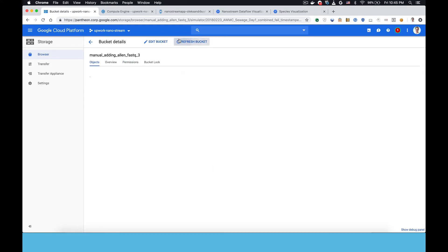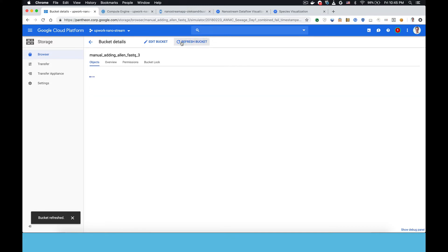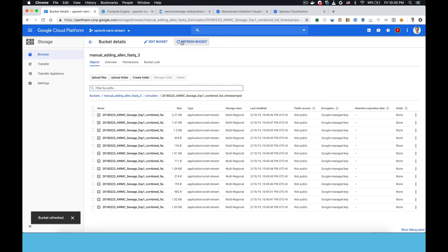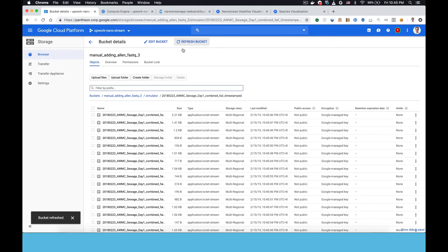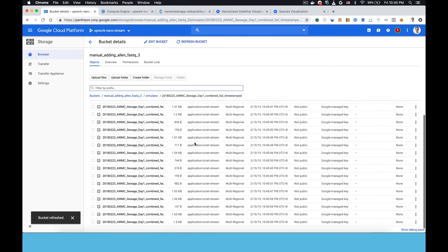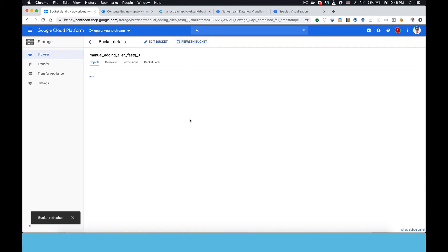Here's the bucket they're going to and it was empty and now you can see reads are appearing. The newest ones are at the top so you can see the time stamps are increasing as these are uploaded.